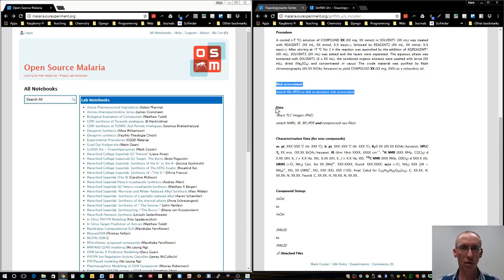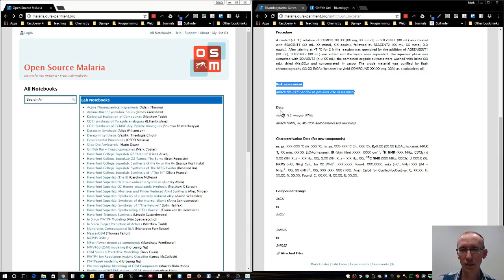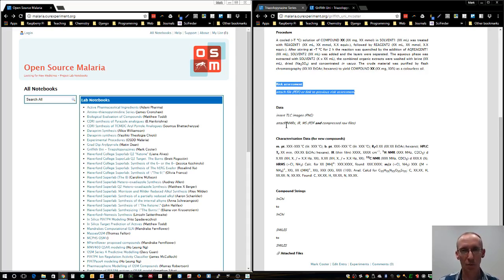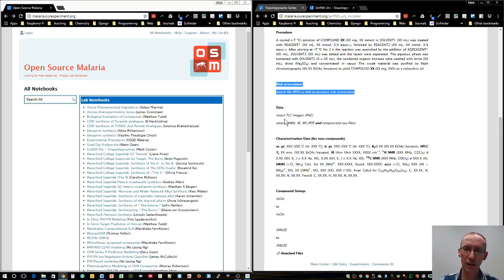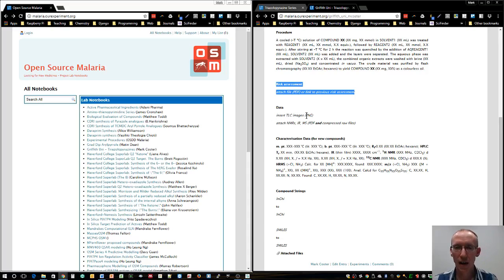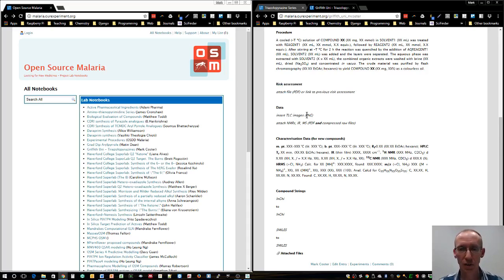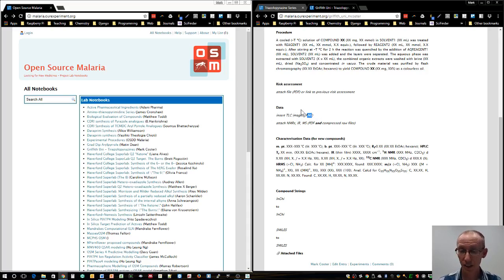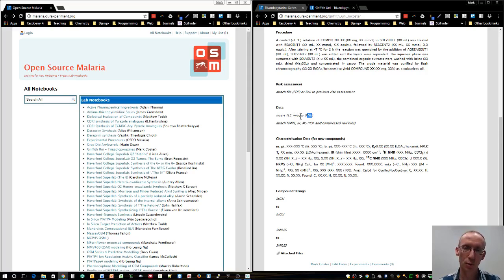As your experiment proceeds, you'll generate data: TLC plates, photographs, NMRs, infrared, perhaps mass spec, and you can attach these as files of various formats. It's really nice if you can use PNG or JPEGs of TLCs so you can see them directly in the lab notebook entry.